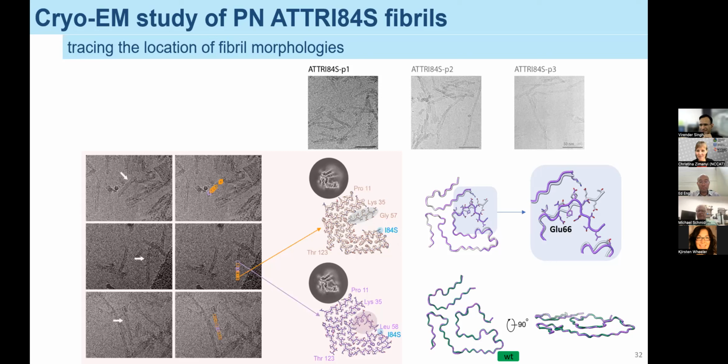Thank you. I think this goes to the question of Christina too. What kind of mask was used for the 3D classification to get those two classes? I think you kind of answered that: if it's a smaller mask, then you can split these things up rather than getting them averaged together, and you see the two classes stand out. Right.